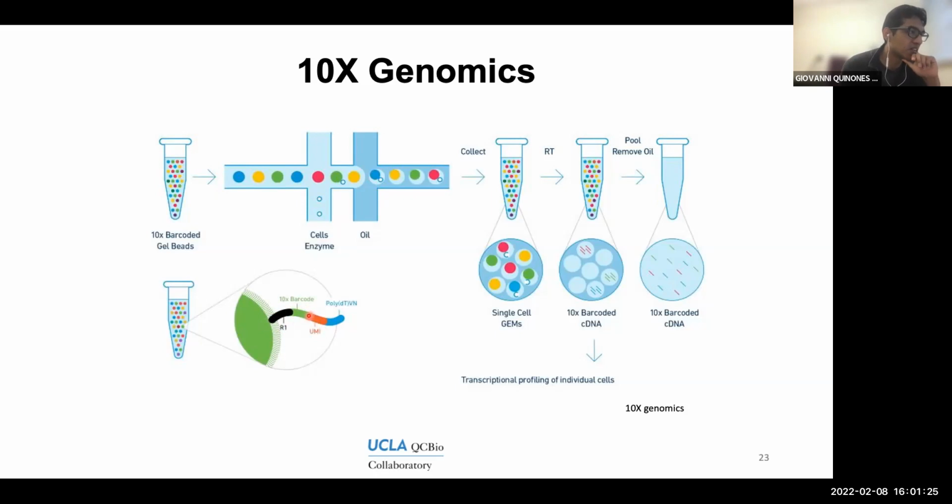This is because every one of these oligos is meant to capture an individual RNA molecule that came from that particular cell. And we're assigning the cell's label here in the barcode. So this is the mechanism by which we're able to implement a UMI, this identity, to every molecule and for every cell that we're sequencing.